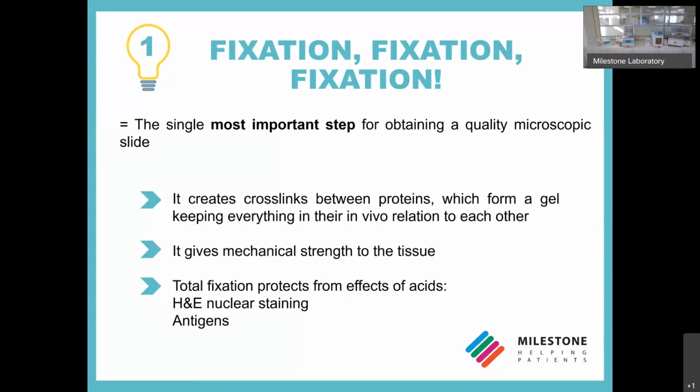If it is not carried out under optimal conditions, a tissue can be damaged, and the information coming from the samples will be totally compromised. Fixation preserves the cells and tissues in a lifelike state to allow preparation of stained slides.